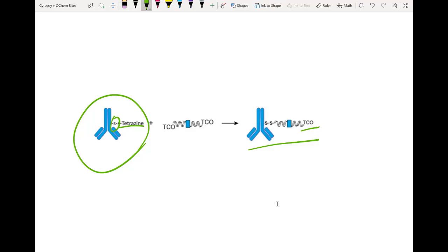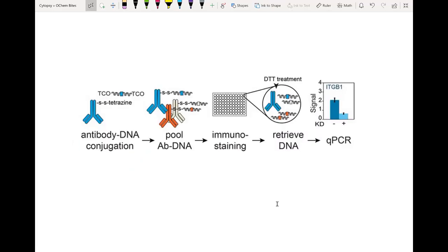Gel electrophoresis can then be used to prove that the reaction completed and to determine how much DNA was added onto the antibody, and that's it.